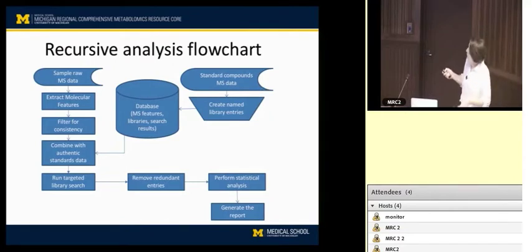And there's a little bit more that goes into what a feature really is in terms of the way we do the analysis, but I'll explain that again later. But think of it, to begin with, as just some signal that we've detected, at least a single peak that has some mass and some retention time.